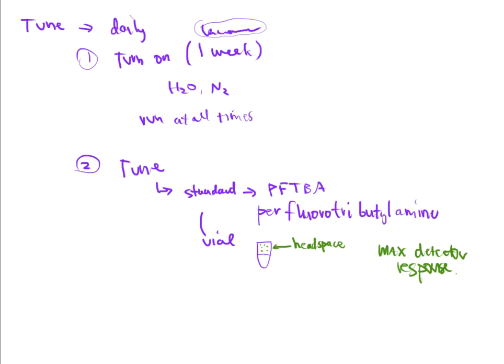So we recently talked about the importance of tuning a machine. We said that we have to do this on a daily basis, if not twice a day, depending on the company that I work for. And these tuning files are something that I want to save and put into a folder, because it gives me an idea of how dirty my instrument is getting. I can refer back to this data to figure out where along the process it happened.